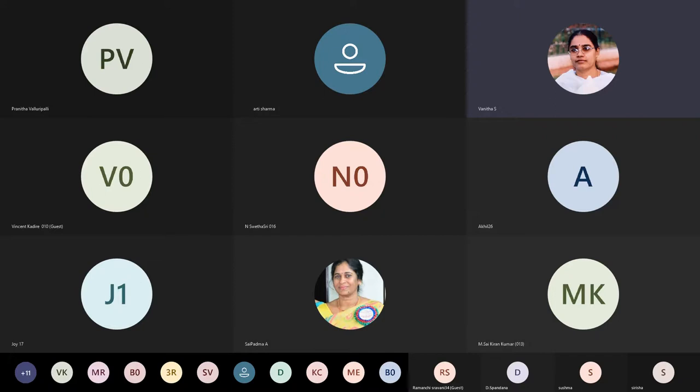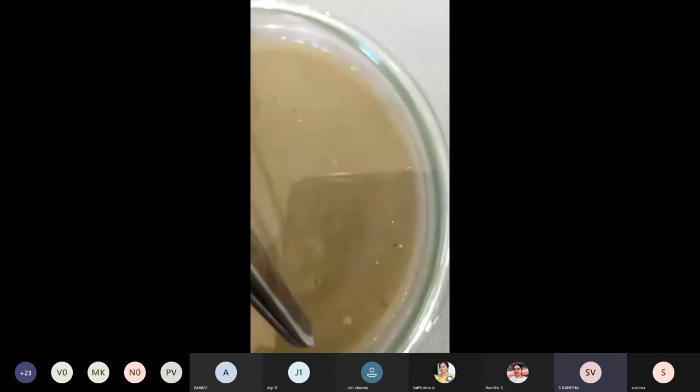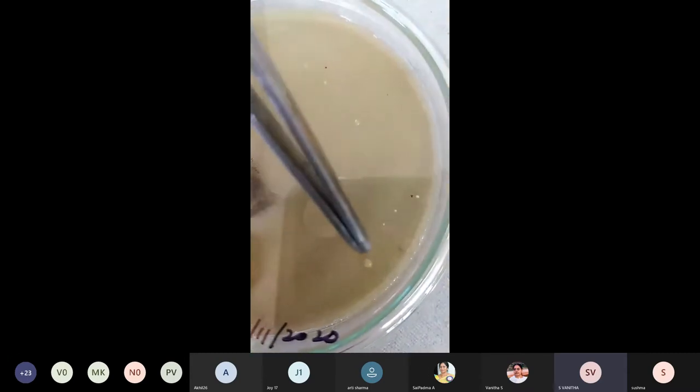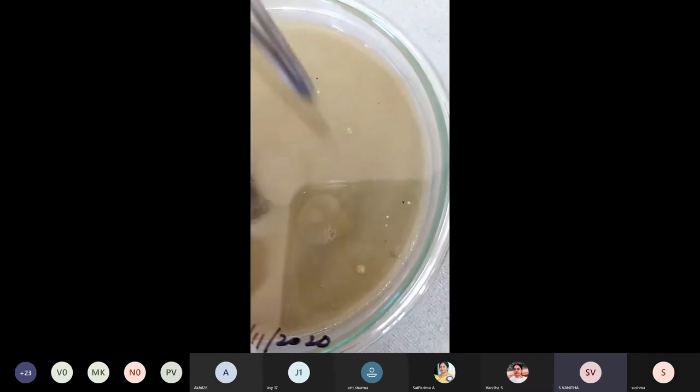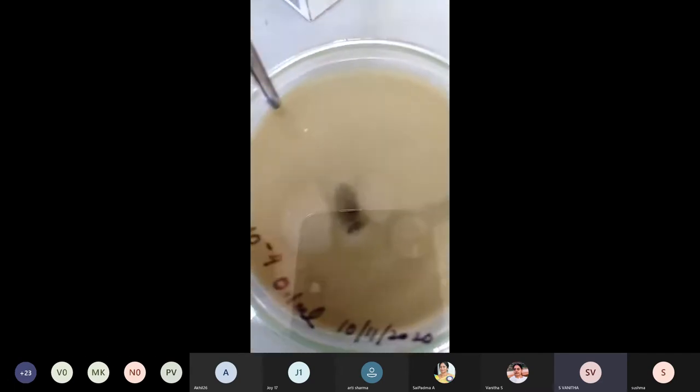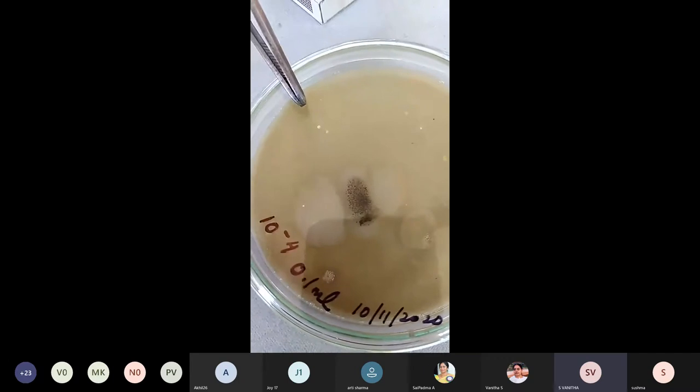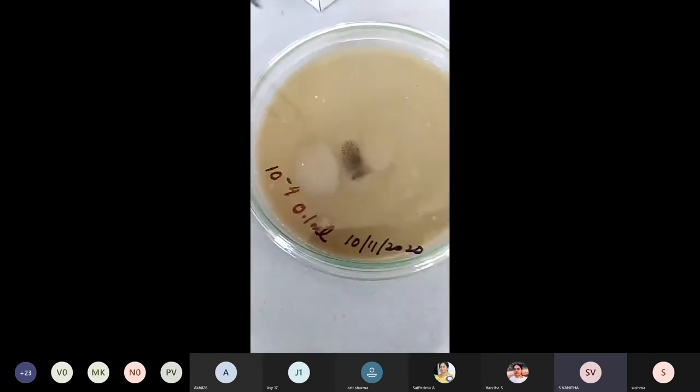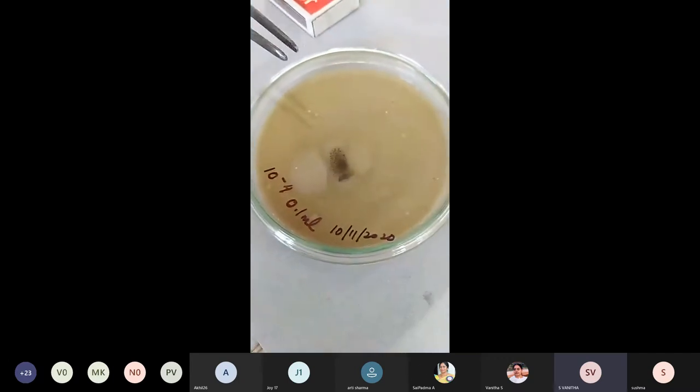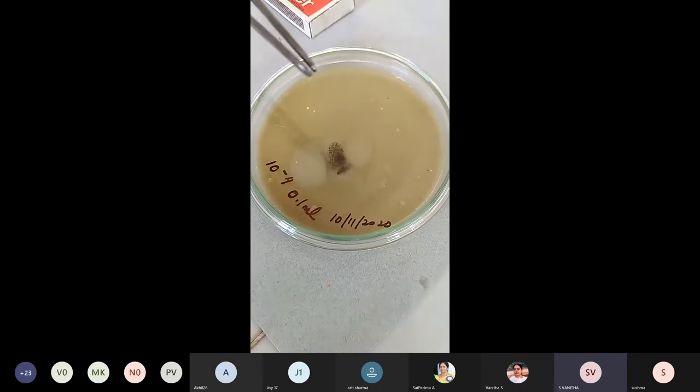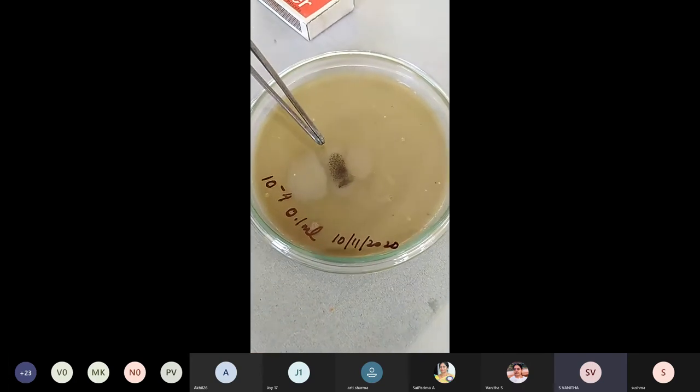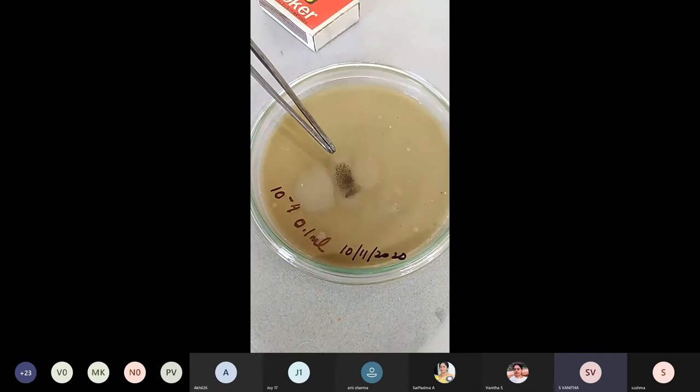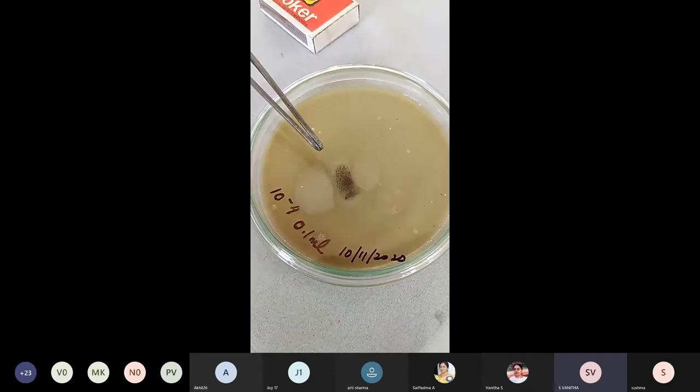That is just a bacterial colony here, one dot here, one small one there. You see, this is the one. This is going to be the bacterial cultures. You can see here one more. You can see some of the colony small colonies are there. They are all the bacterial colonies. So this is by the plating method what we have done earlier. From this what we have got, we are going to consider this to be a fungal source and we will do the staining. It is a fungal culture.